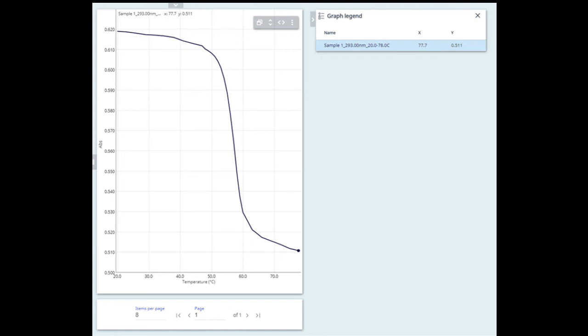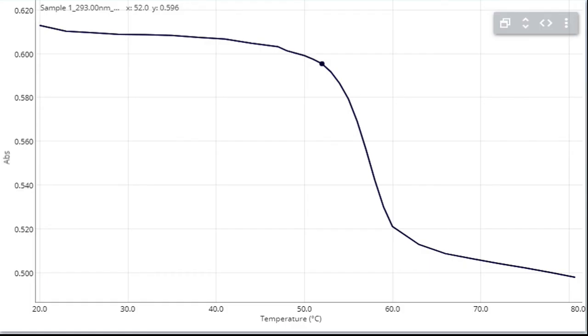Okay, so this is kind of what it looks like. You can see at the beginning, in the first stage, the temperature changes much less rapidly than in the middle, which is near the transition, or during the transition, changes much more rapidly, and then it starts to change much less rapidly for the last section of the data collection.